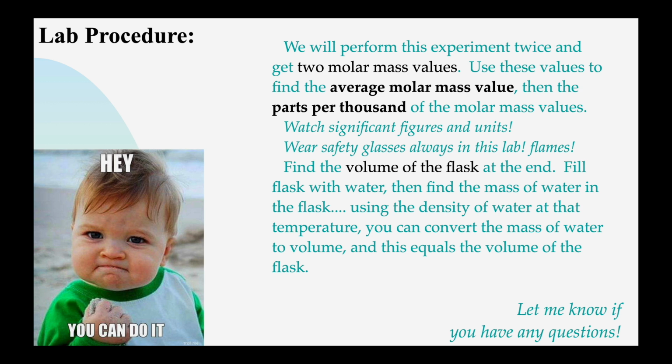We're back in the world of significant figures in this lab. In the last labs where we drew Lewis structures, we didn't think about that too much, but we're definitely back there now. So try and watch that. Also watch out for the units, all right? Most of the units we record in the lab will have to be converted before we find the molar mass. This is a lab where, if you do it in the lab, we will have to have safety glasses on all the time, because the safety glasses will hopefully keep our eyes safe from everything. So just be aware of that.